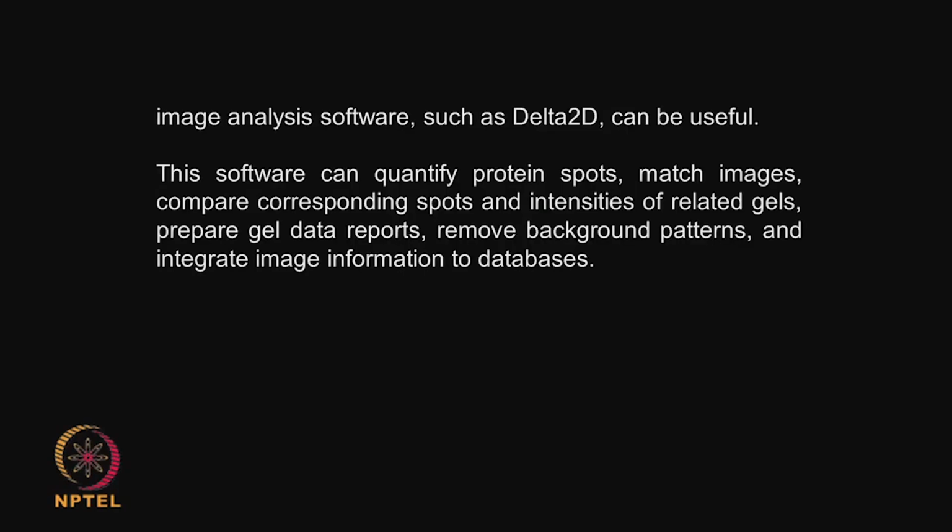The proteins would have lost their activity here, especially when you run through the SDS PAGE, but this is a very useful technique if I want to look at the individual protein and characterize it in more detail. There are many softwares available which can help you. They can compare with the existing database and then say possibly this is the protein.